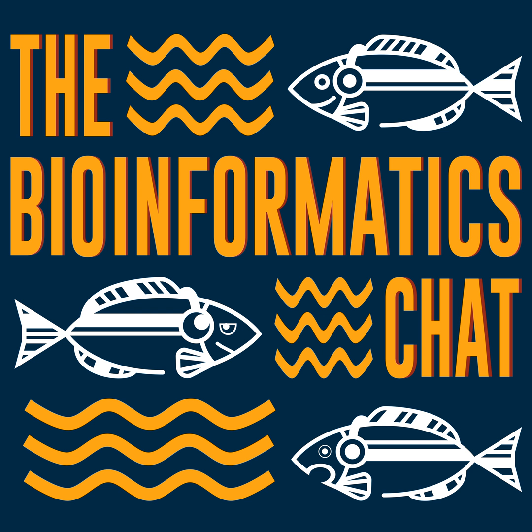Do you assemble a human genome? Do you assemble some kind of E. coli or a virus? We try to assemble different genomes. We try to make sure that Flye works well on a wide range of genomes. So currently Flye is faster than the early hierarchical approaches, but I must also note that other assemblers are getting faster as well. They're getting optimized, and even hierarchical approaches have become faster.